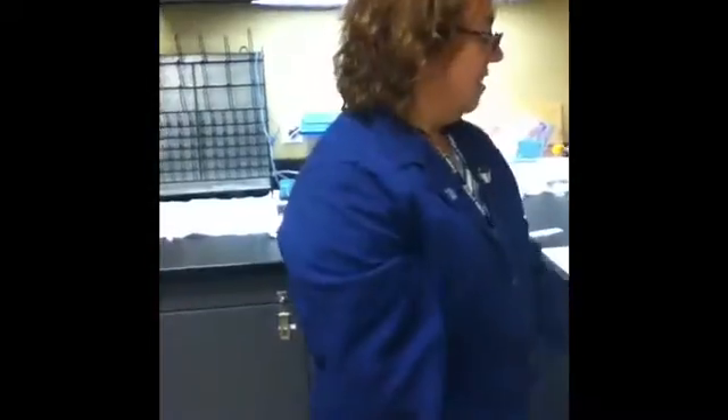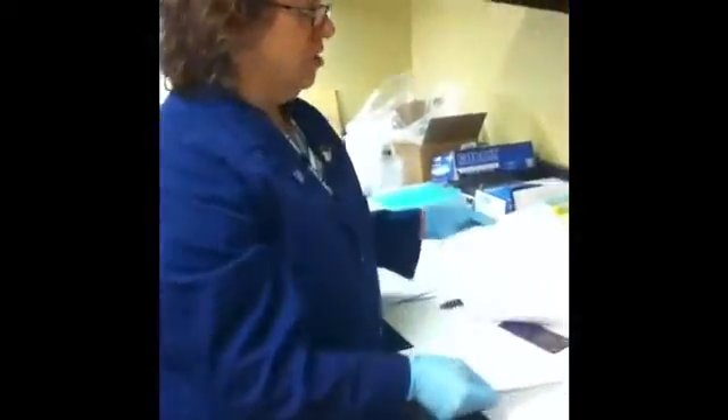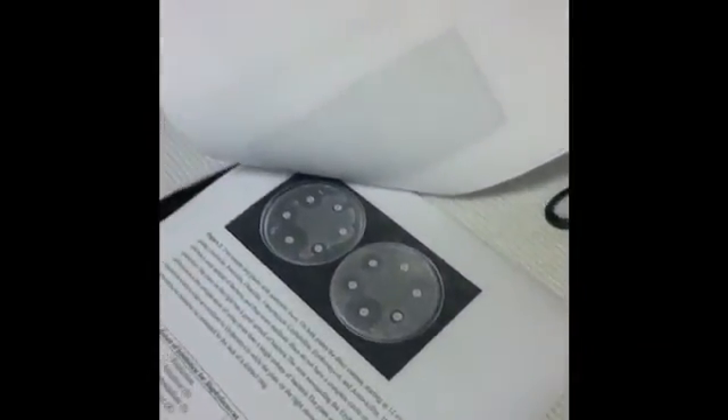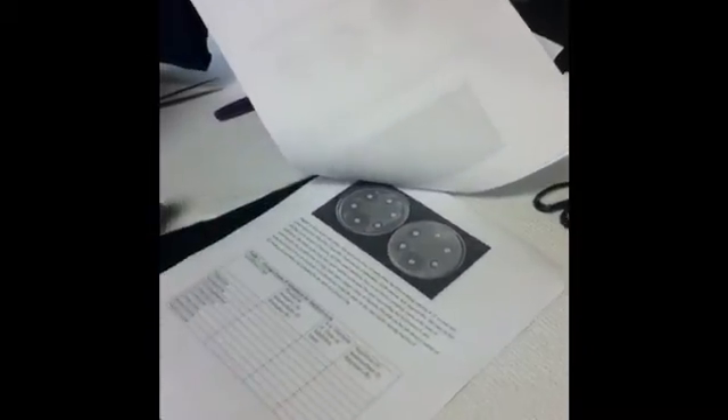Next week we'll be able to observe the results without a microscope. You should have zones of inhibition — this is how your Staphylococcus reacts with the different antibiotics.